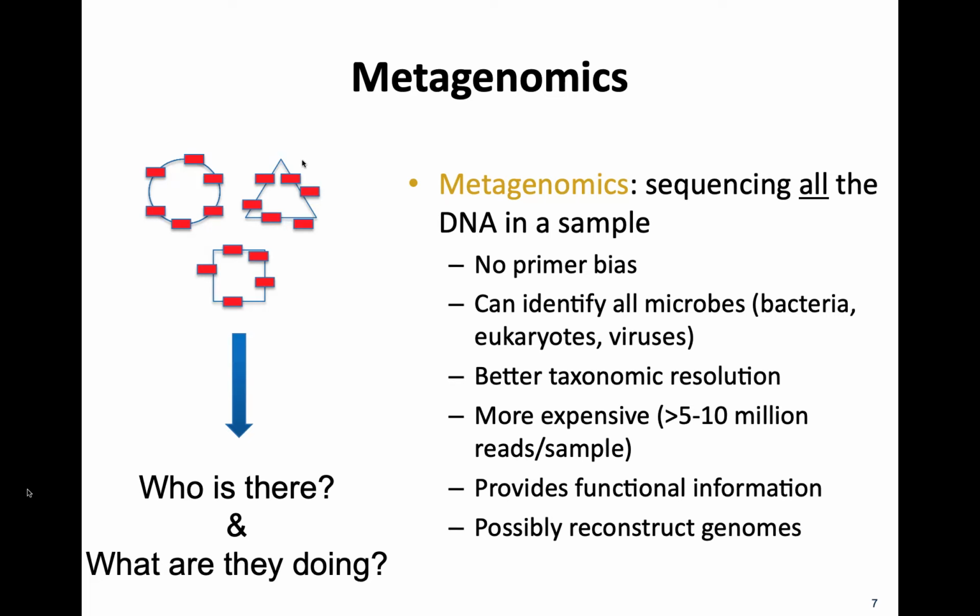Some people think it's fine, and some people argue it's better than 16S. I don't really have a strong opinion about it. I feel like if you're going to do metagenomics, it probably doesn't cost that much more to get a full metagenome, right? So we're talking about shallow metagenomic sequencing costing you maybe $25 less a sample. It's hard to say. Metagenomic sequencing does vary a lot. We're talking sort of in the $100, $150 range per sample compared to 16S, although we have seen a drop a bit across the board.